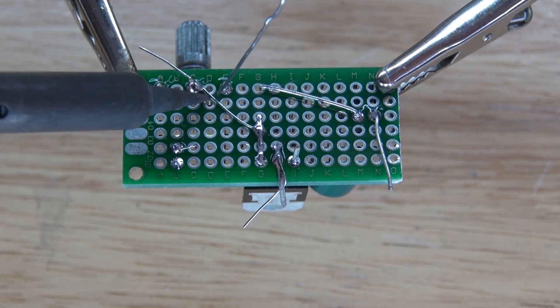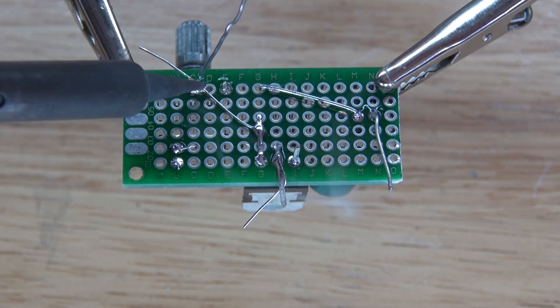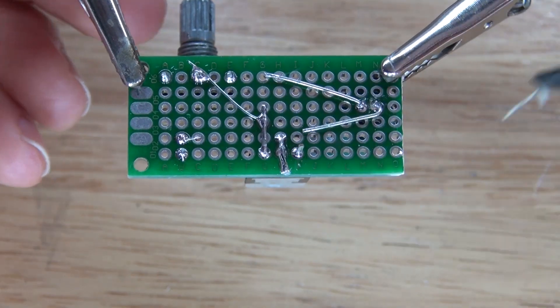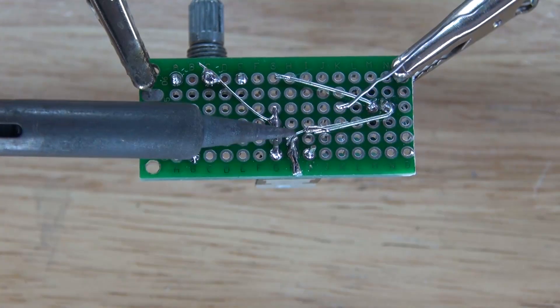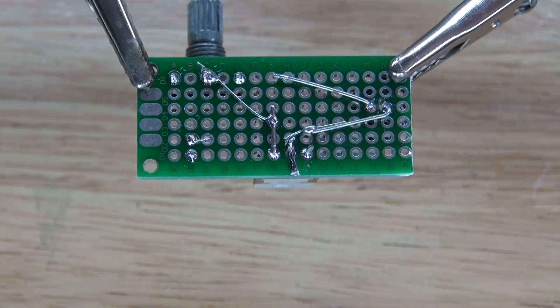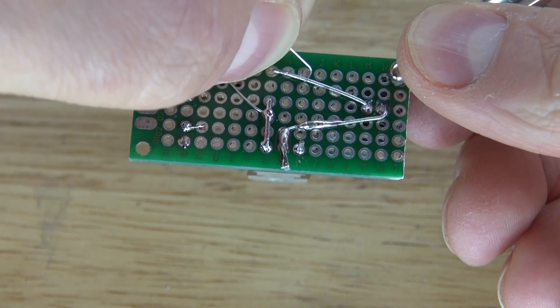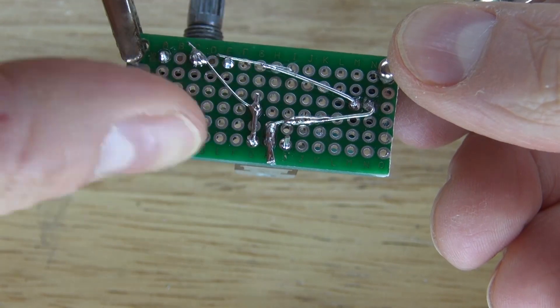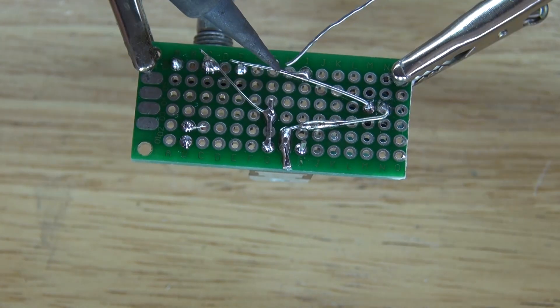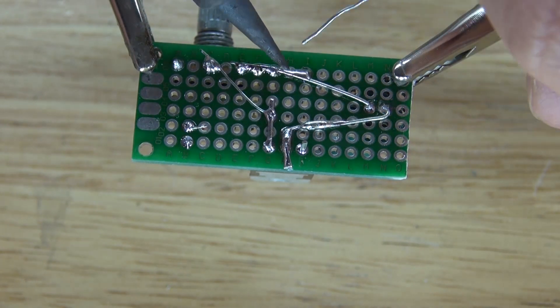I'm soldering the 680 ohm resistor to the center of the potentiometer, and it's connected to the adjust pin of the voltage regulator. Cut off the excess. Next I'm going to take a bridge wire and connect it to the positive of the electrolytic capacitor to the center pin of the voltage regulator, which is the output. Then I'm taking another bridge wire and connecting the negative of the electrolytic capacitor to the right pin of the potentiometer.